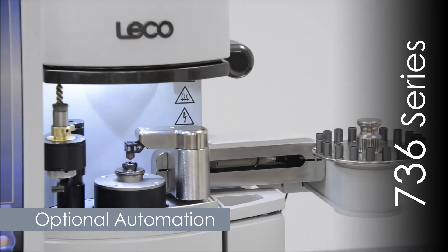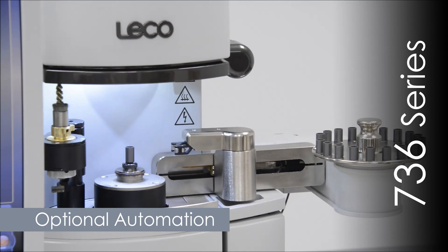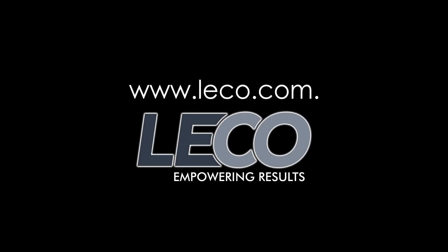An optional 20-sample shuttle loader is also available. For more information about this series or other total analytical solutions from LECO Corporation, contact your sales engineer or visit www.leco.com.